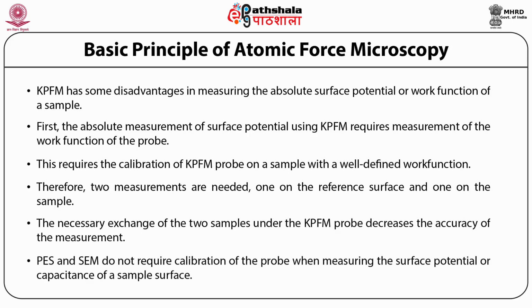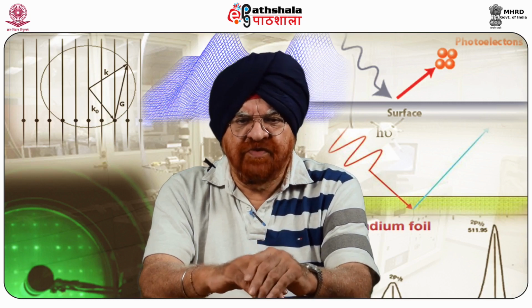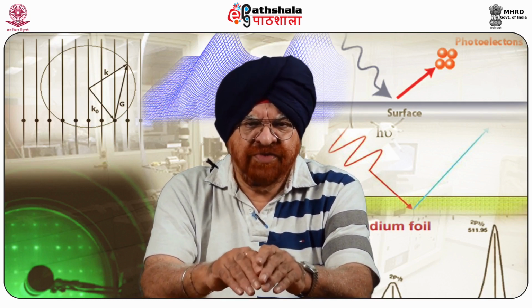PES and SEM do not require calibration of the probe, and measuring the surface potential or capacitance of a sample surface becomes easier. The preparation of atomically sharp and conducting AFM tips is critical for high-resolution KPFM.